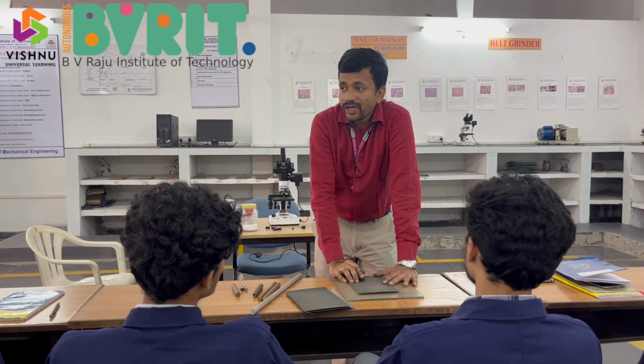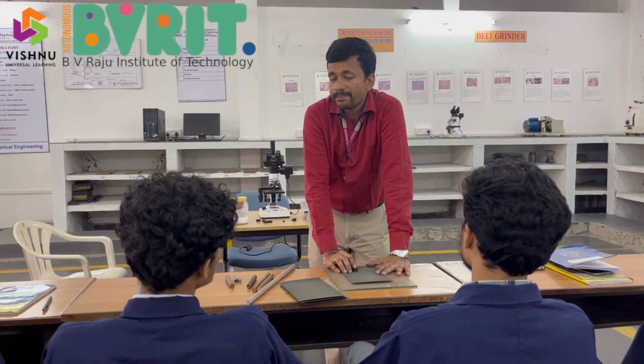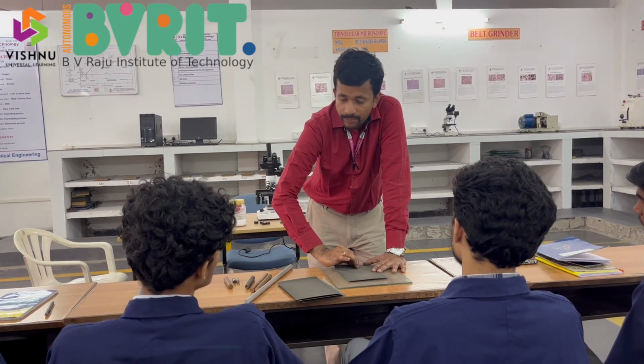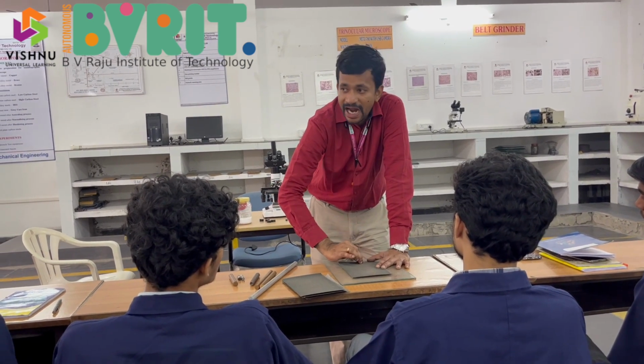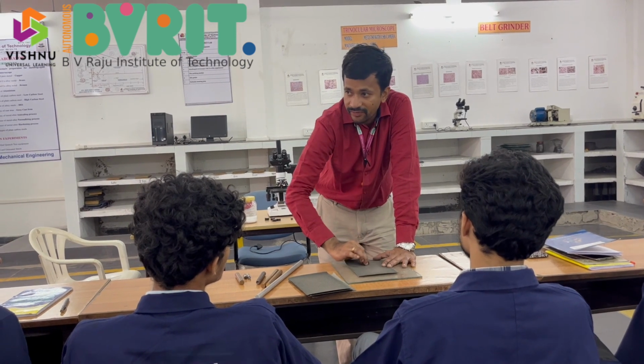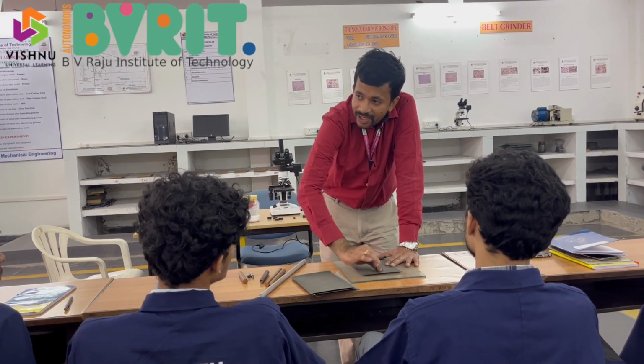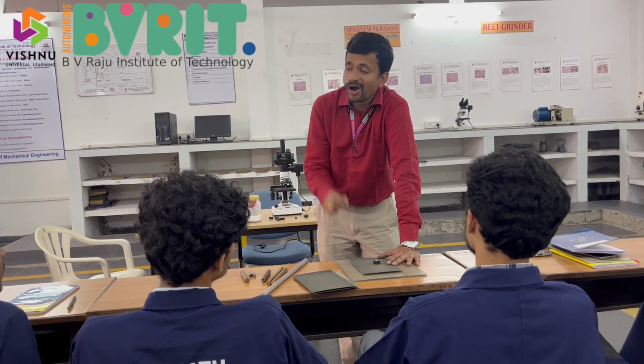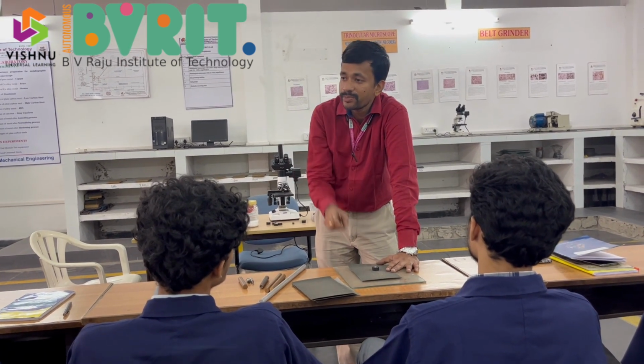So this we call as manual polishing. In the process of the polishing, what we do is we start from one end and move forward, lift it and then start back again. This is the process that we follow. If you do this way, you are creating scratches. I want to remove the scratches in order to get that mirror finish. So first I need to remove the scratches.